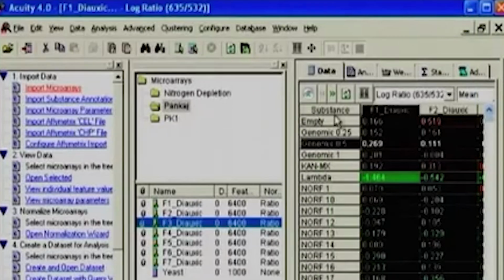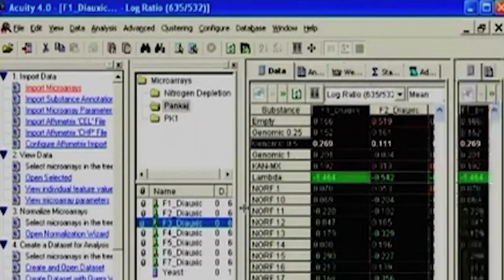So once you have all the data normalized after the import, and you have the annotation and parameter file ready for you, there are a few ways with which you can look at the data. Before moving forward, it's important to ensure that normalization was done properly, and one needs to look at each slide carefully. Yes, as we discussed earlier, it's essential to have the same normalization process done for all. And it is not a thumb rule which one is more preferable. One can choose anything, but make sure all your different slides are handled in a similar way.